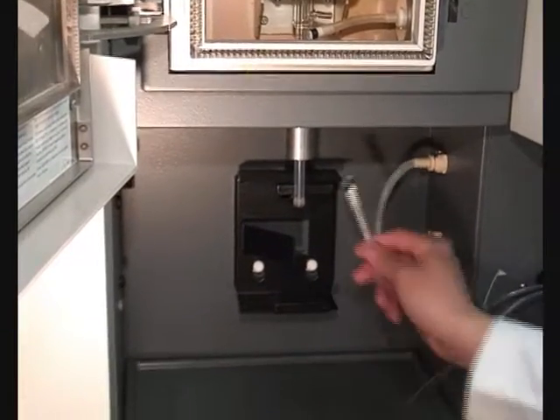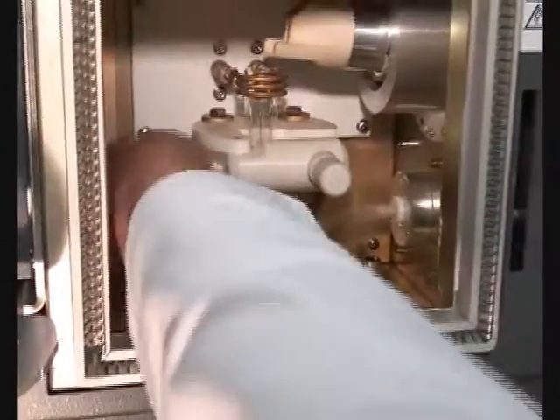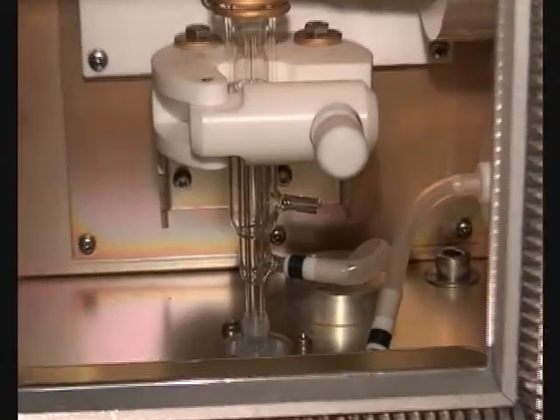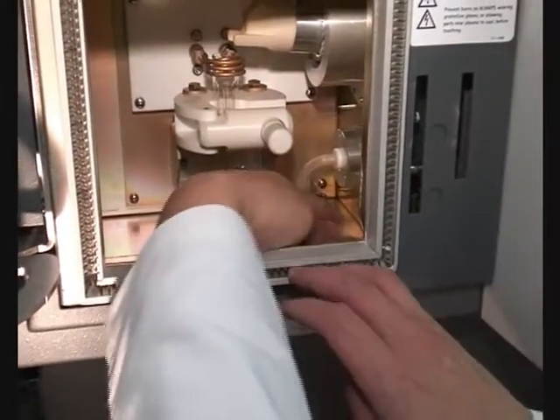Connect the intermediate tube of the torch to the auxiliary gas outlet. Connect the plasma gas hose to the output nipple in the torch compartment wall.